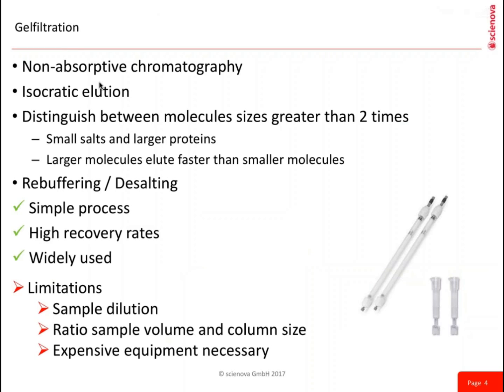It distinguishes between molecule sizes greater than 2 times, and therefore it's ideal for the separation of small salts or ions and larger proteins. The larger proteins elute faster than smaller molecules, and as I said, it's ideal for desalting or rebuffering. It's a very simple process, and you can gain high recovery rates, and it's widely used.